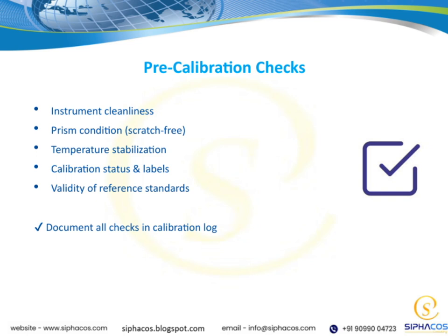Remember, all these checks must be documented in the calibration log. It's a vital part of maintaining traceability and ensuring quality control throughout the process. These steps are fundamental to achieving precise and consistent calibration results, which ties back to our overall goal of maintaining high measurement integrity.